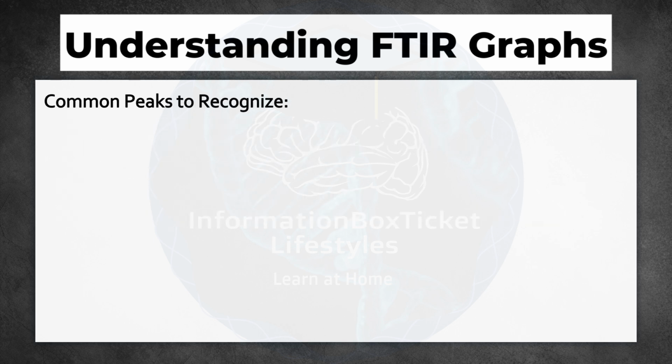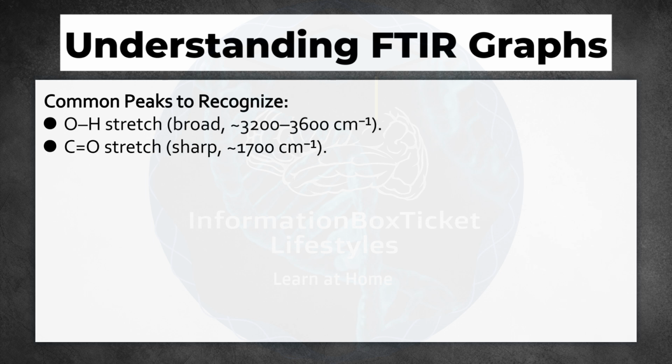Common peaks to recognize. OH stretch, broad, approximately 3,200 to 3,600 cm⁻¹. C=O stretch, sharp, approximately 1,700 cm⁻¹. C-H stretch, 2,800 to 3,000 cm⁻¹.